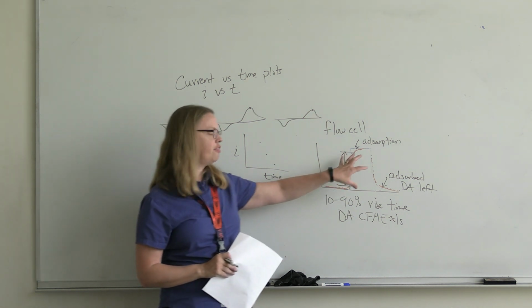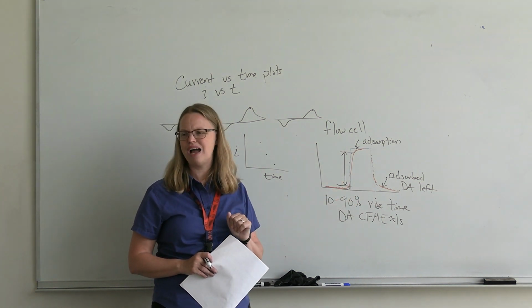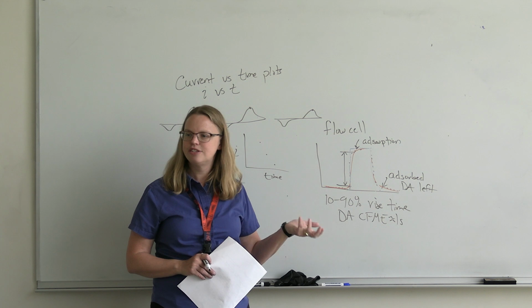These are very helpful though. We use these all the time because you want to know how something changes over time, how dopamine changes over time in your brain. You don't want to look at 2,000 CVs or 200 CVs. That's 20 seconds' worth of data, 200 CVs, right?